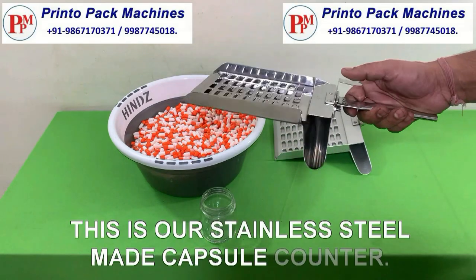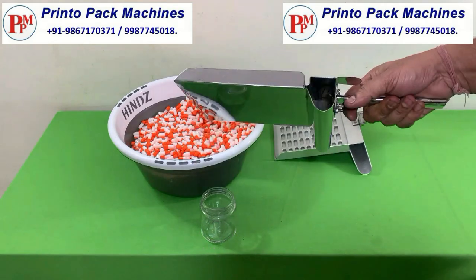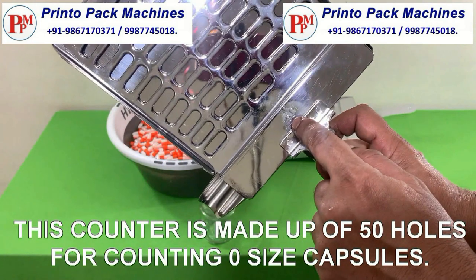This is our stainless steel made capsule counter. This counter is made up of 50 holes for counting zero size capsules.